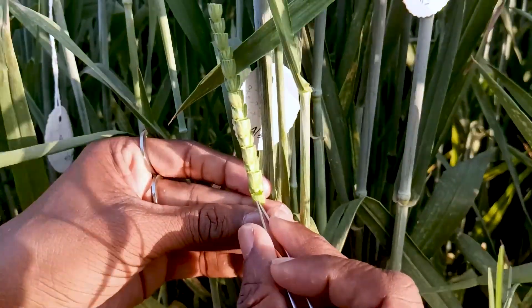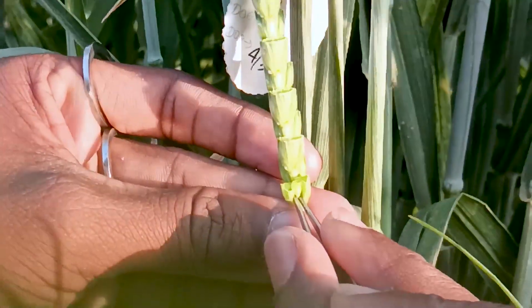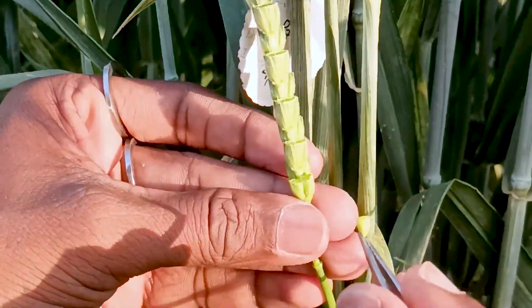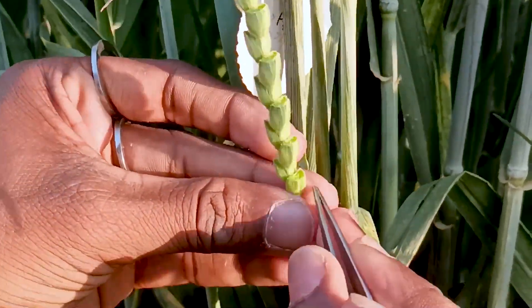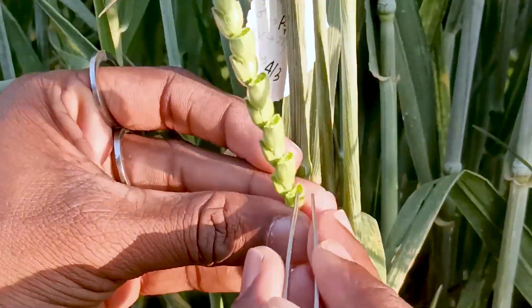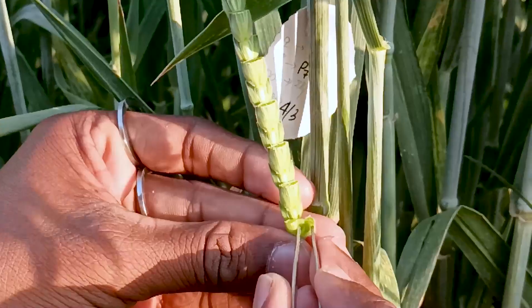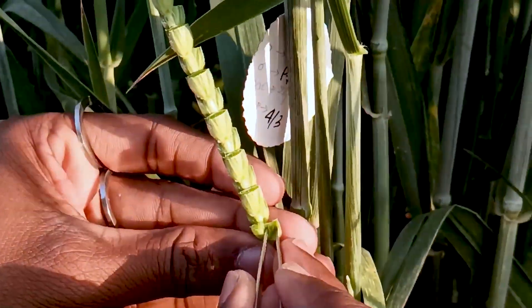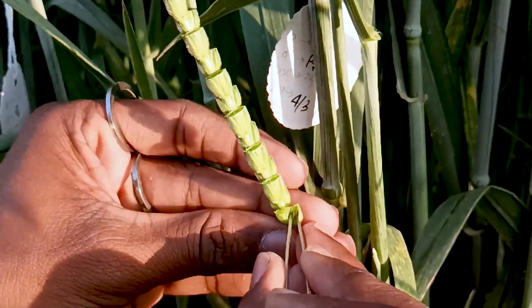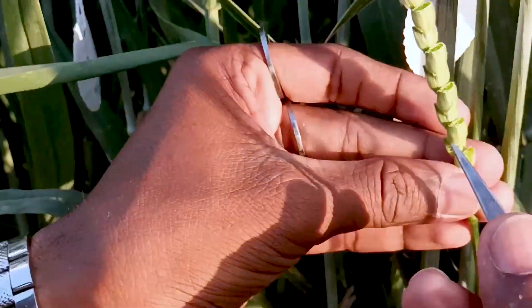We have to remove the middle florets — three florets total. Here we remove one, but if there are more then we remove two or three florets from the middle, keeping only the side florets. Between the lemma and the palea there are three anthers and one stigma. When the anthers are immature they stay green.